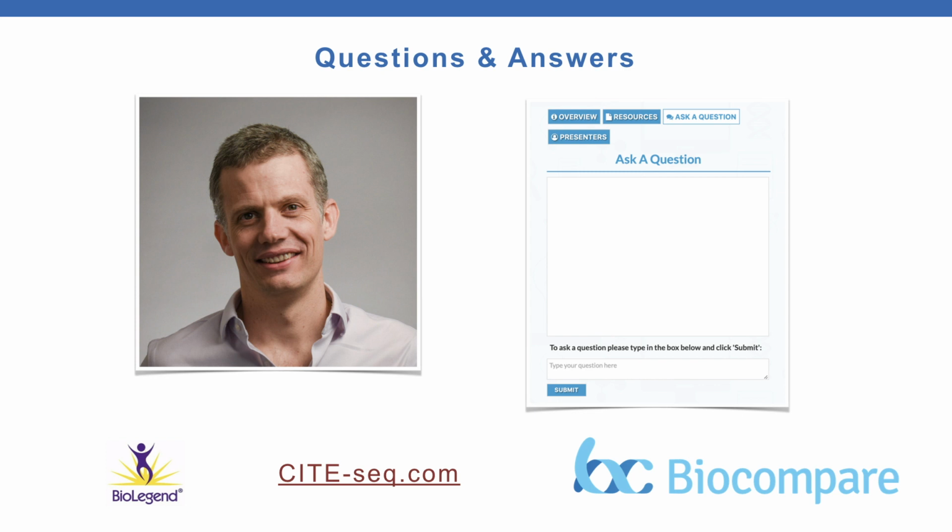Yeah, so we've run it. We initially developed CITE-seq on DropSeq. We started working on this before 10x had a single-cell offering. And then we quickly, obviously, adapted it to 10x.